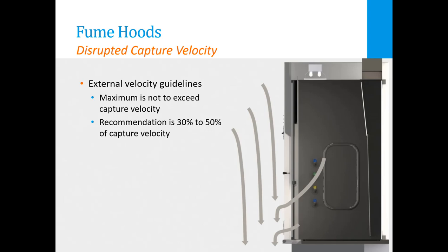The capture velocity can be affected by external air motion either from movement of occupants in the room or those working in the hoods. This disruption of capture velocity can result in air and contaminants escaping the hood. Air motion in front of the hood should never exceed the capture velocity and generally should be less than 50 feet per minute. It is recommended that the velocities in front of the hood are designed to be 30 to 50 percent of the capture velocity.